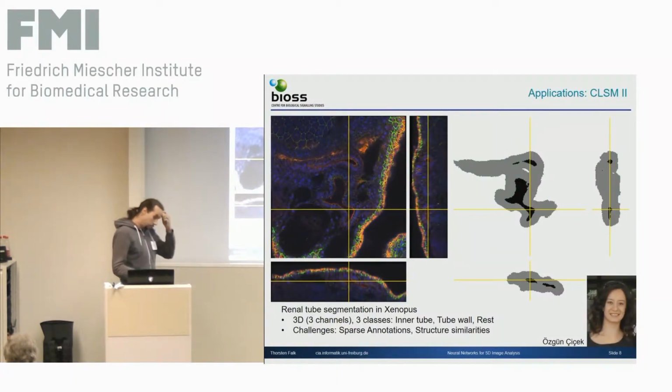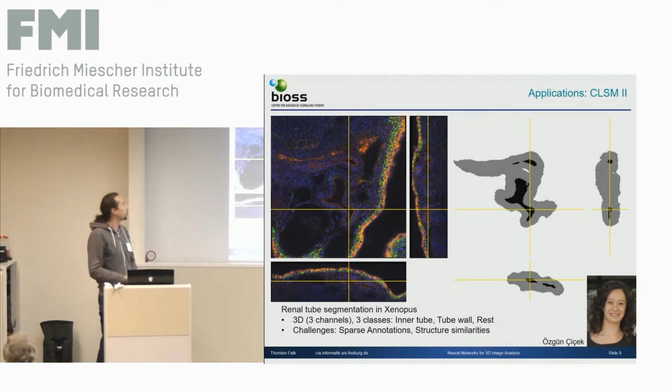Well, all I heard up to now was mainly processing 2D data. So we're in big data, and we want to also process 3D data, of course, especially if we have, for example, a SPIM that can produce very beautiful 3D data in masses. Then we also want networks that do 3D. And actually, we have an architecture that needs only very small adaptations, and we can do 3D with that.